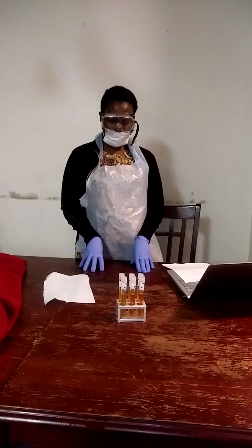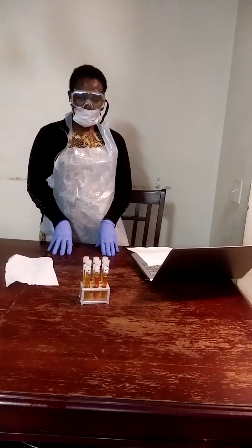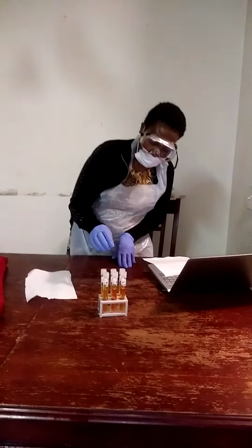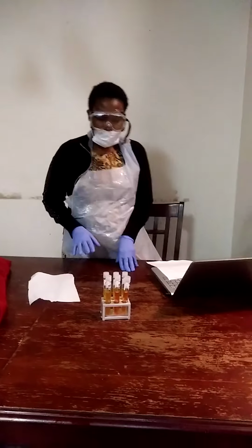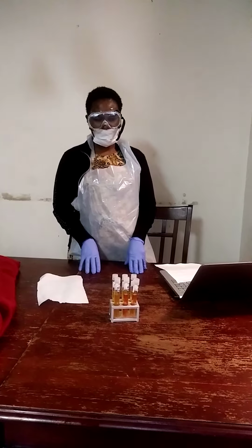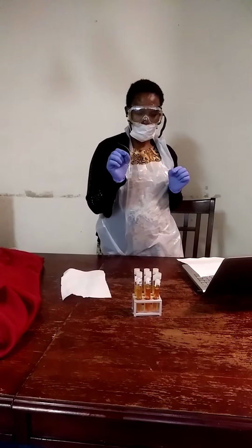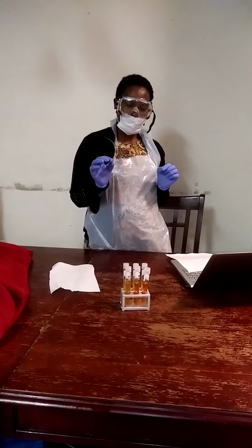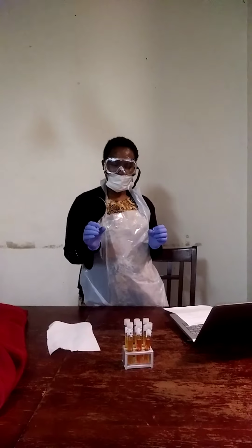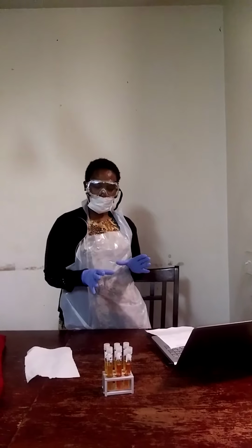How I did it is I just followed the instructions, and I had my broth, the phenol red test tubes, the 6 of them that I've already marked, and then I was supposed to put some carbohydrate in each tube so that I can test the reaction thereof.